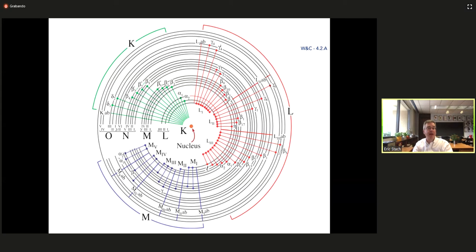Anthony Rutherford asked, how easy is it to flip between the different techniques? Do you just switch a dial? The answer is yes and no. To go from diffraction to image, there's a button. You hit a button called diffraction, and all that does is change the intermediate lenses to go to the diffraction pattern, and when you hit the button for magnification, it goes back to the image mode, just like that.